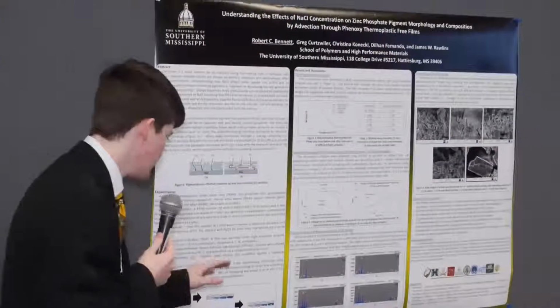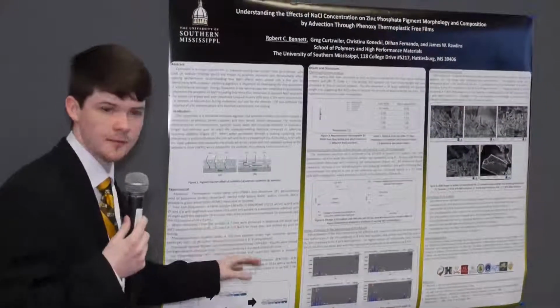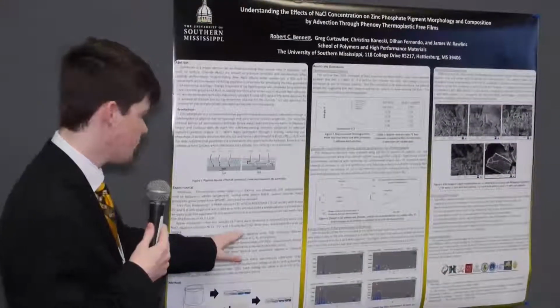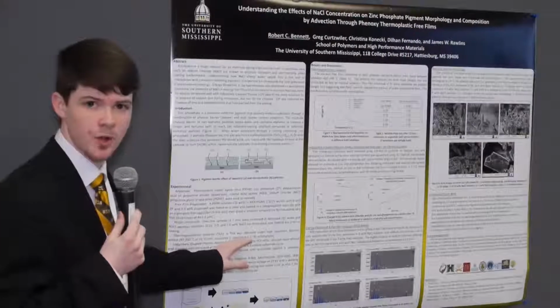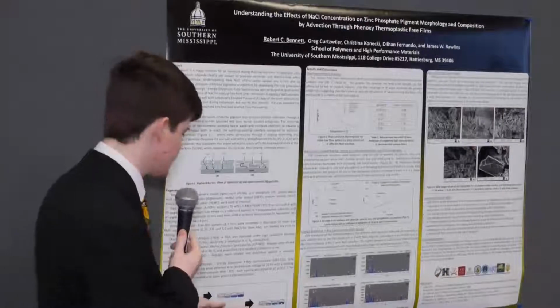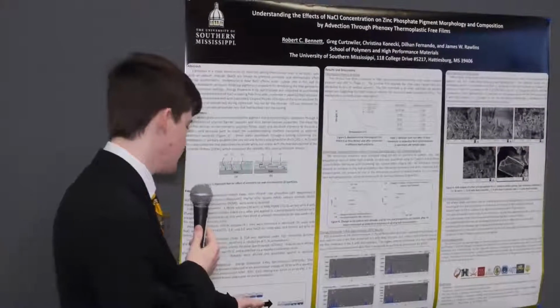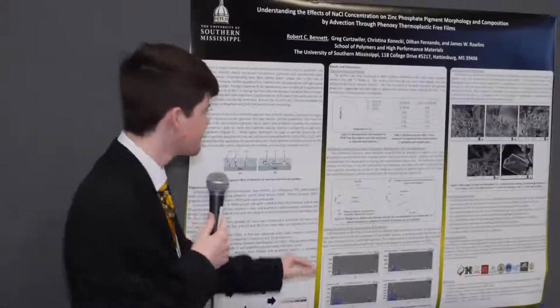So we have a drawn down coating, removed. 4.7 millimeter discs were punched out of it, immersed in 10 mL of solution containing no salt, 0.25% salt, 3 weight percent salt, and 5 weight percent salt.